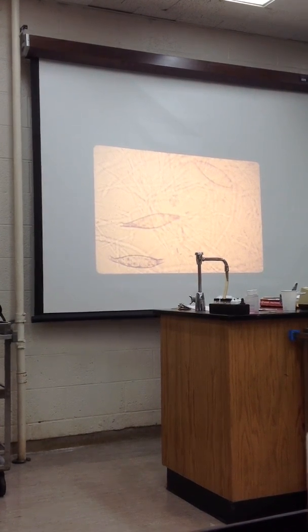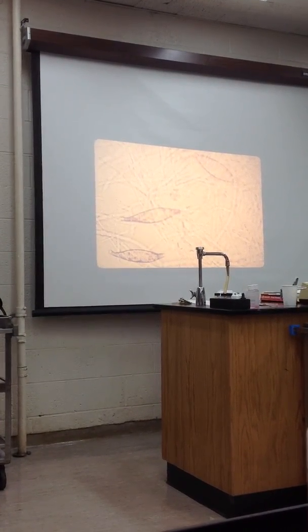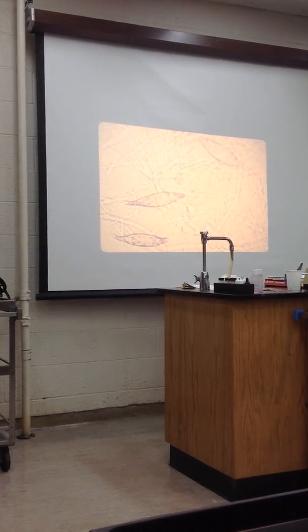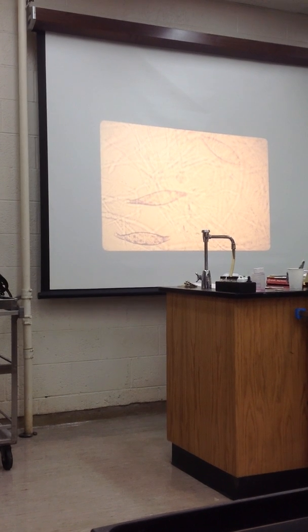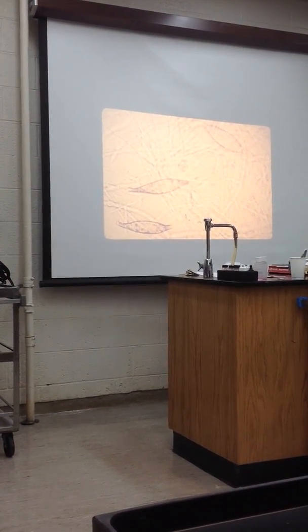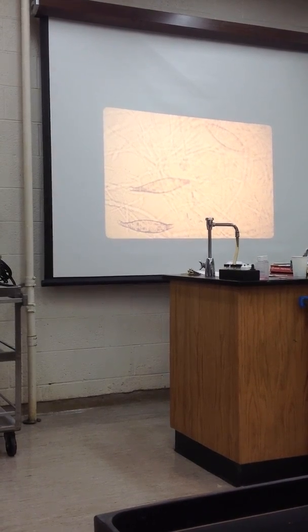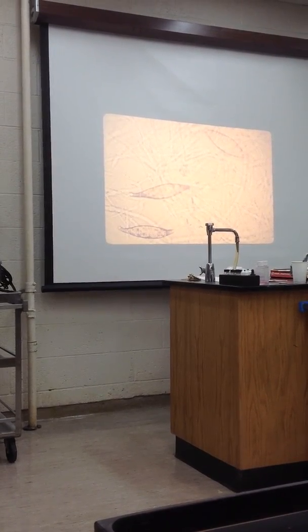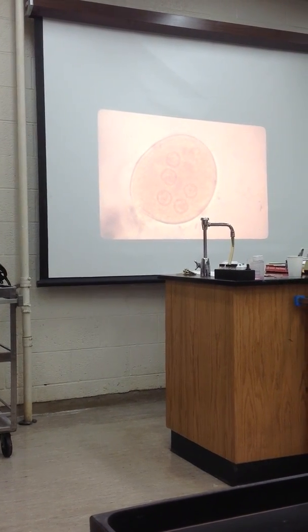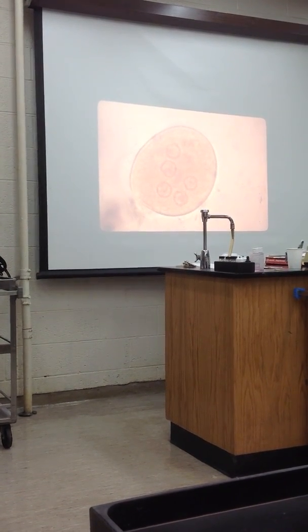That is the macroconidia of Microsporum canis that causes dermatomycosis. The macroconidia, not micro, macroconidia of Microsporum canis. Macro, M-A-C-R-O. Microsporum canis. What is it called again? Ringworm.